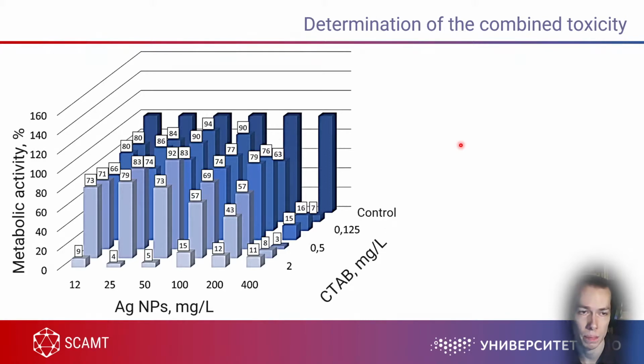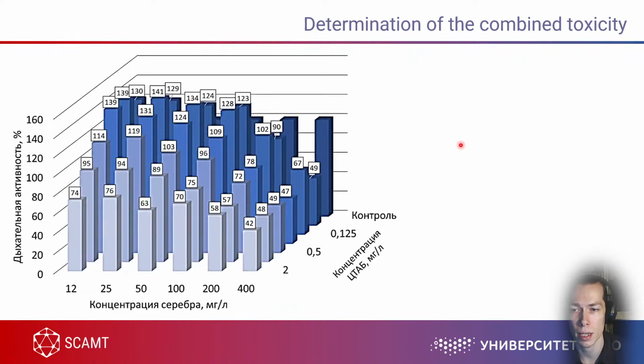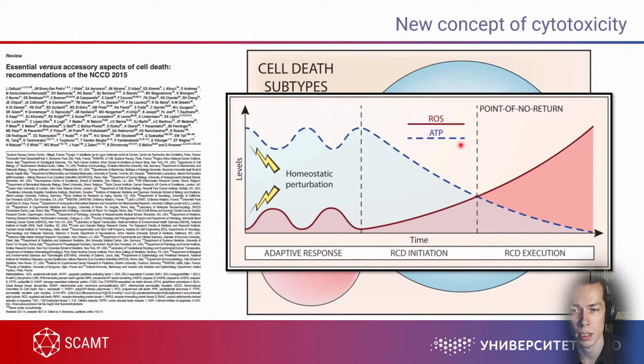Why does this happen? Well, the answer is quite mysterious, but I can only suggest that all of this phenomenon happens because of depletion of glutathione inside the cells. Look at this plot.